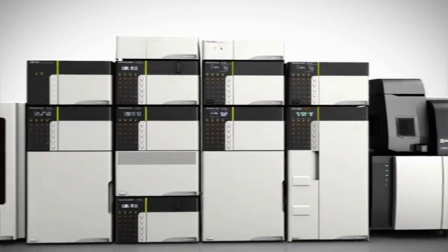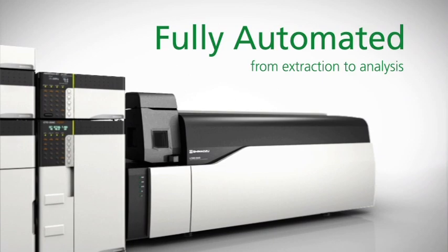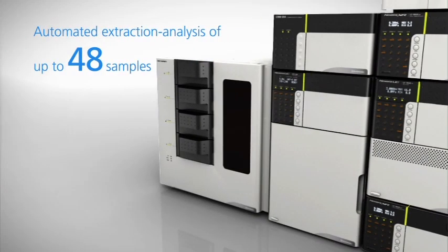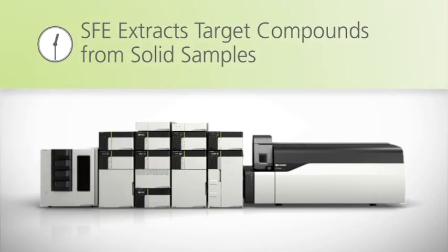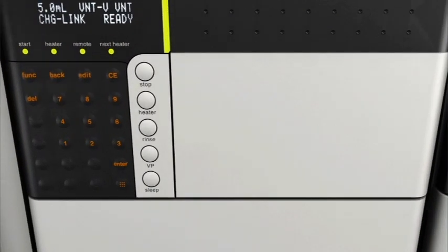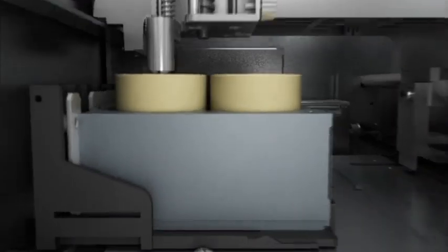Process automation from extraction to analysis to instrument shutdown can be achieved with Nexera Uc. Up to 48 samples can be extracted and analyzed using high sensitivity UFMS detection, enabled by the new low-volume back pressure regulator. The Nexera Uc online SFE-SFC-MS system is a groundbreaking analytical tool that combines supercritical fluid extraction and supercritical fluid chromatography.